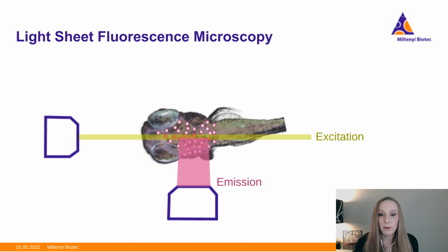So the really nice thing about this is that the excitation beam can propagate through the width of the sample, and therefore the light sheet itself is creating the optical section, compared to some other technologies that you may be familiar with. This means that there's no requirement for blocking out-of-focus light, so you get a little more efficiency here, and on top of that, we have no amplification of the signal with certain PMTs. Instead, light sheet microscopes are really able to acquire that entire field of view in a single camera frame. And then if you combine this with being able to do the axial translation, so this would be either moving the sample through the beam or moving the beam through the sample, this is able to then really quickly generate a 3D volume of the biology that you're imaging.